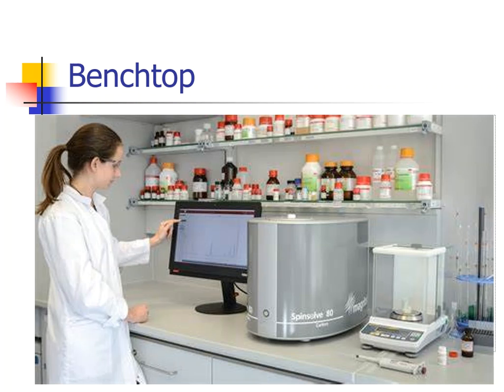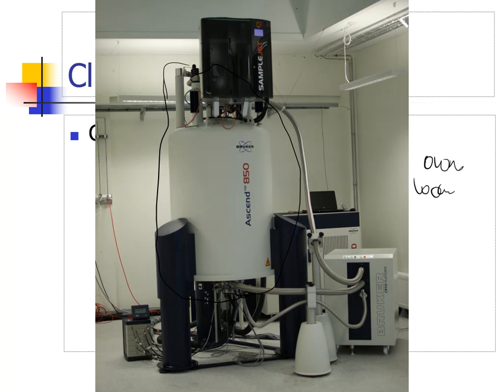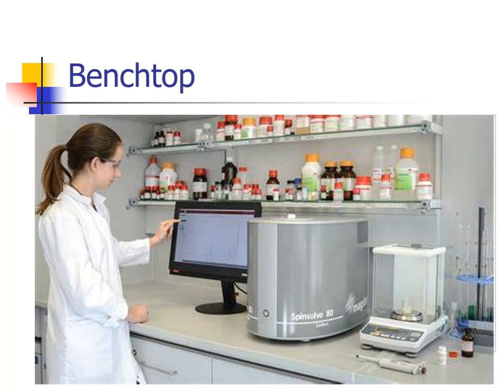These are typically kind of expensive. If you take a look at what I would call traditional scale NMR, these machines will cost anywhere from $500,000 to $1 million or more, depending on what you need and what kind of capabilities you want with it, where the benchtop NMRs will basically come with a pretty simplified magnetic system with computer and software, nothing special here, and these are normally $50,000 to $60,000. So that gives you a price difference between them. So in terms of academic purposes, these are pretty great.